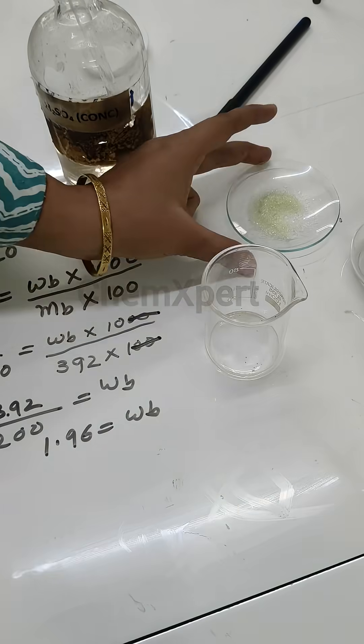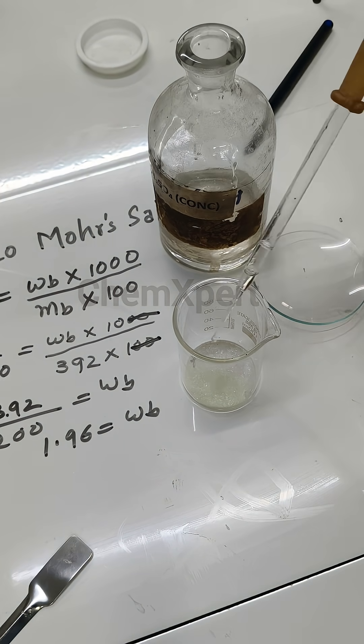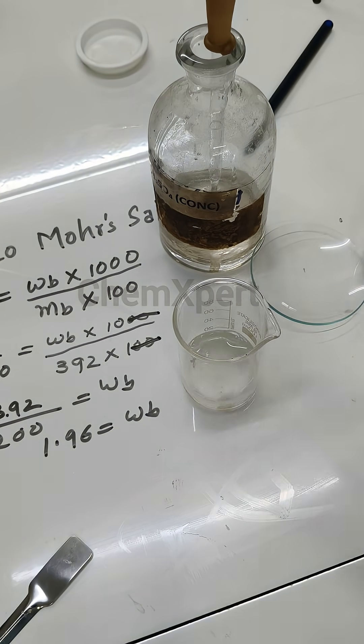Now transfer this salt in a beaker, then add a few drops of concentrated H2SO4 in order to prevent the hydrolysis of this salt here.